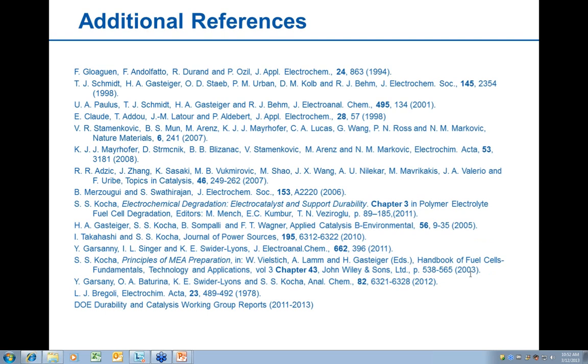Oh, I would agree with Yannick. That's what we do here at Argonne as well, have an airflow. What we do is put the RDE tip very close to a fume hood, and so just the suction of the fume hood provides a nice airflow over the tip. Okay.